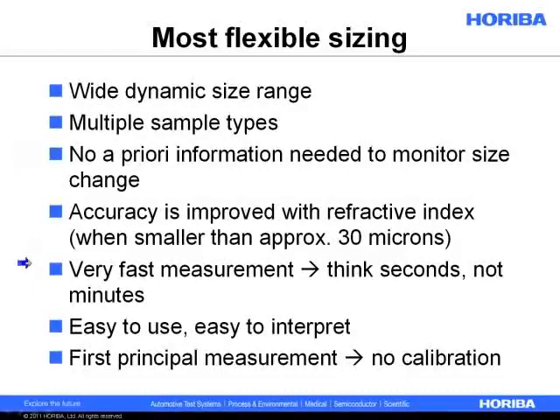It is a very, very fast measurement. You should think of it in terms of seconds and not minutes. A lot of other technologies, X-ray sedimentation, for instance, can take minutes, if not almost an hour for very small particles. Dynamic light scattering is usually a 1 to 5 minute measurement. Image analysis is usually minutes, so diffraction is just about the fastest thing on the market.